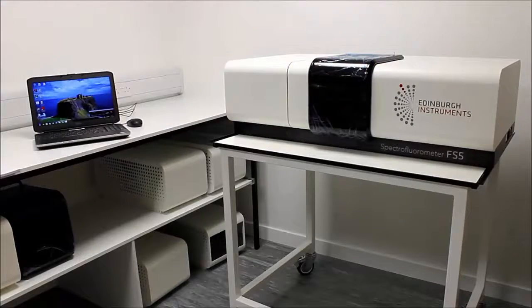Welcome to Edinburgh Instruments FS5 Fluorescence Spectrometer. The system weighs around 55 kilograms and is 1 meter by 60 centimeters by 32 centimeters high. It is installed in a lab whose temperature is 15 to 30 degrees and ideally less than 80% humidity.